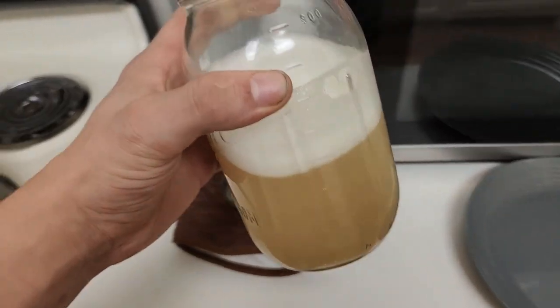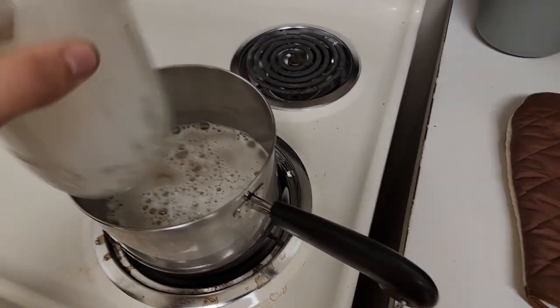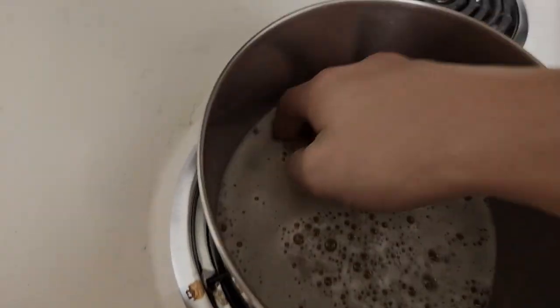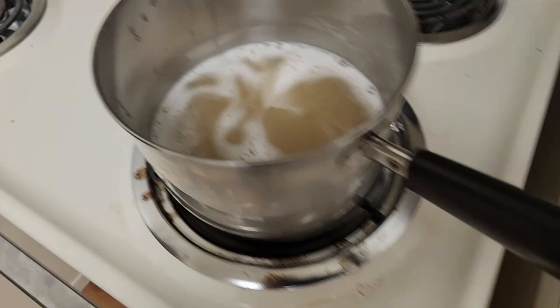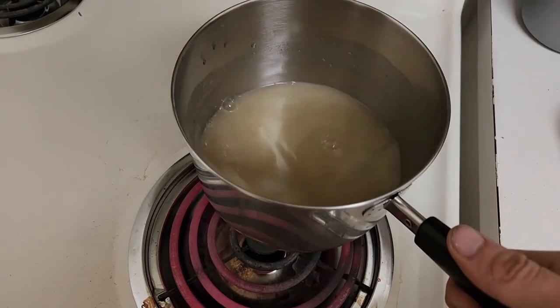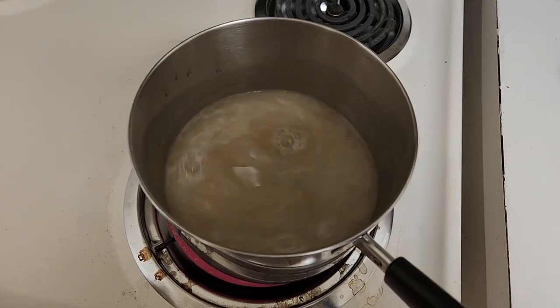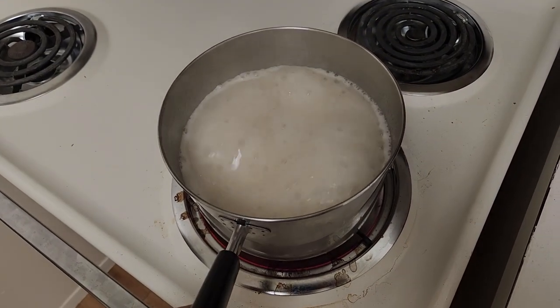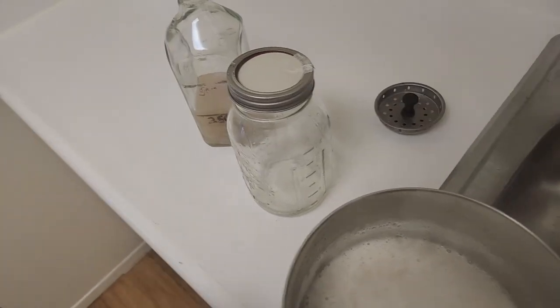Alright, once you got it all stirred up, go ahead and pour it into a pot. And then just bring it to a boil. When you're boiling it, you want to come over and occasionally stir it so nothing gets stuck to the bottom. Once it comes to a boil, that means your agar is fully dissolved. So you can go ahead and transfer it into a container that you want to pour it from.